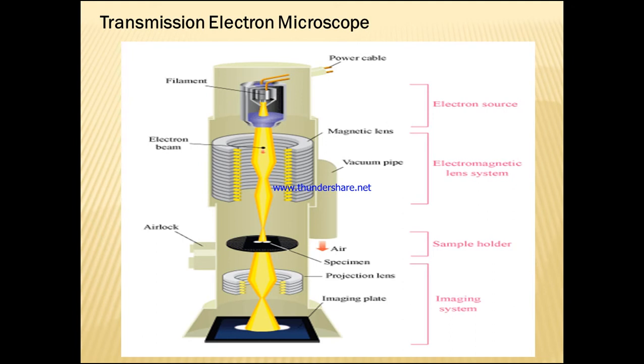The disadvantage of this machine is only that it is expensive. The device is costly, and it is operated by skilled workers. Skilled researchers or skilled persons have to work on this TEM. If we do not have the skill or the training, then we can't operate it. It is a large piece of equipment, so we require space for it, and maintenance is high for this TEM. The operation and analysis require special training.